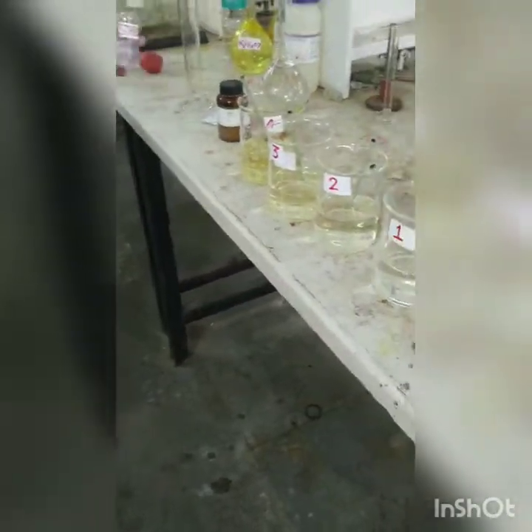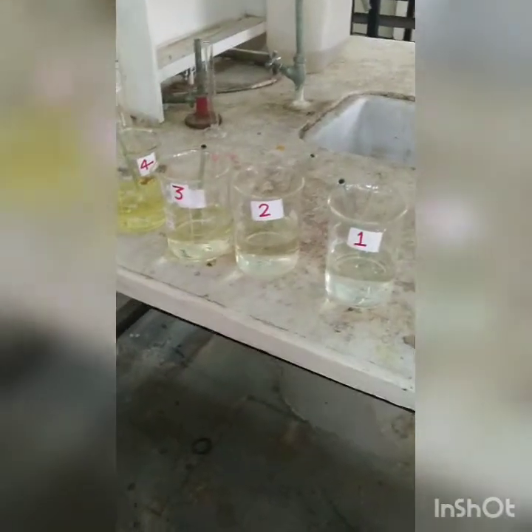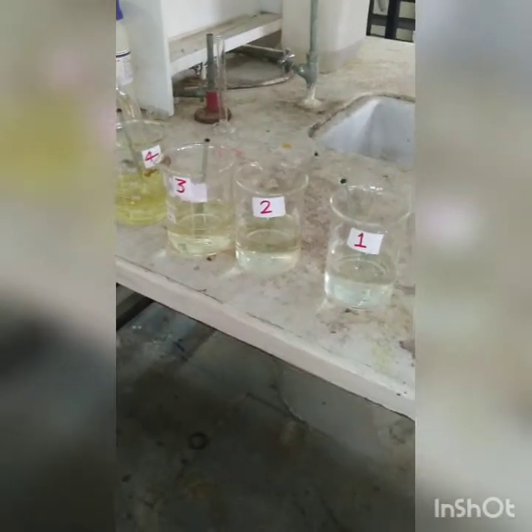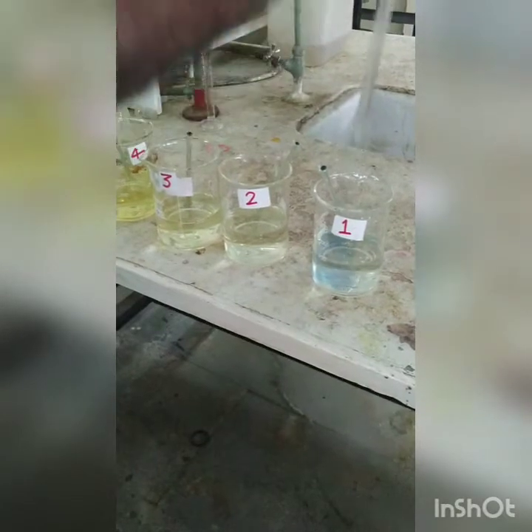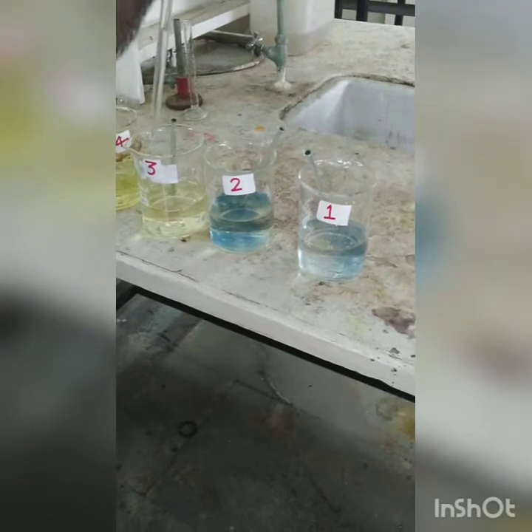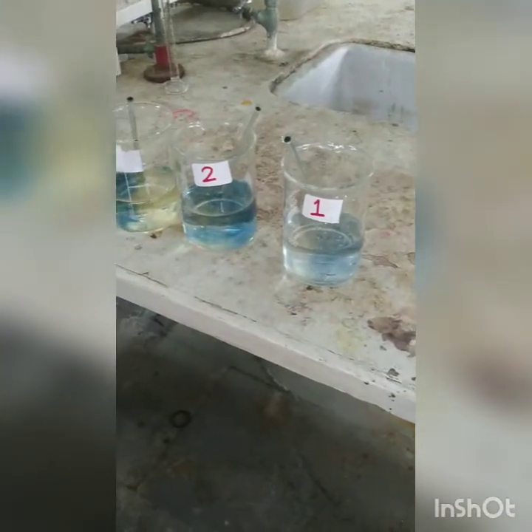Now we have to add 1 ml of starch indicator. Now you will see that our concentration or the dosage of chlorine is increasing from beaker 1 to beaker 4, 0.5, 1, 1.5 and 2, and same thing will get reflected in the color intensity also. You can see that as compared to beaker 1, beaker 2 has got dark blue color. Ingole sir, you just mix it so that it will be more clear.